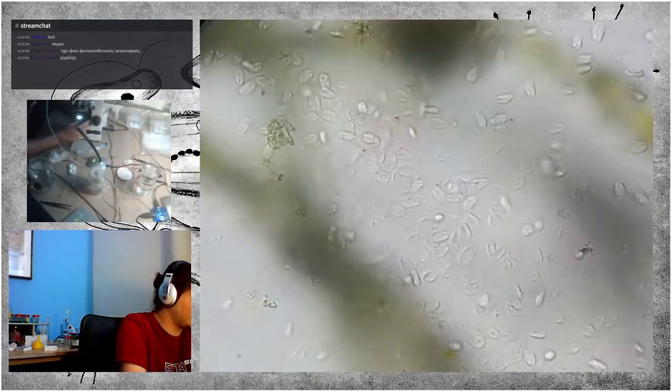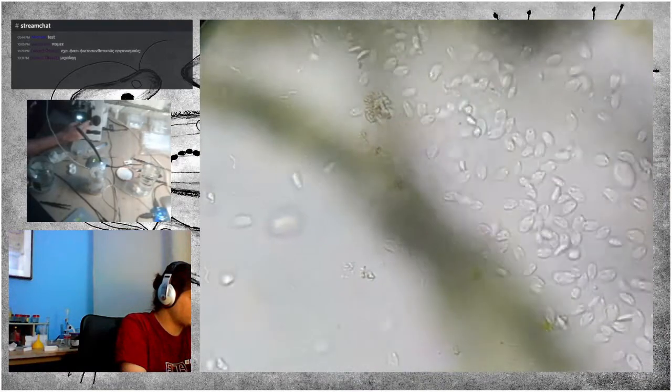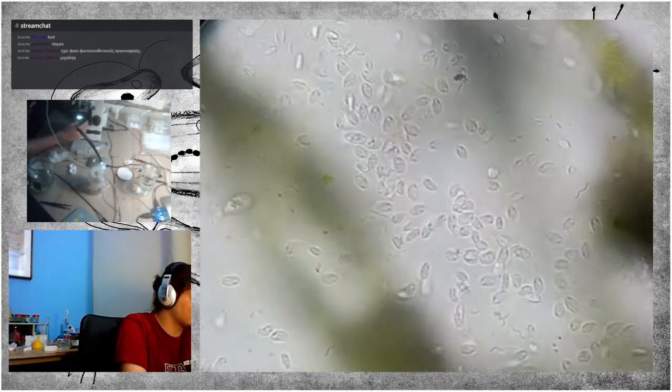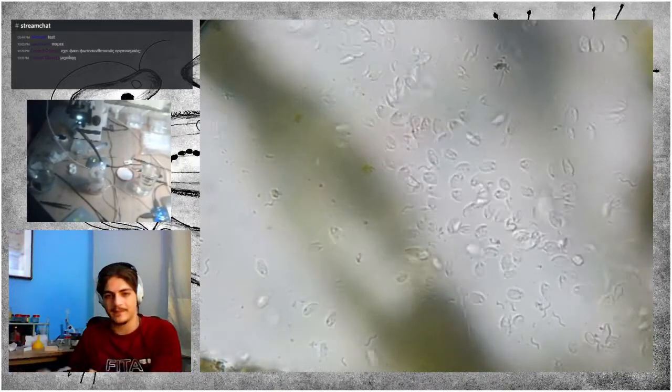I have seen in that large of a concentration only flagellates of probably the genus, let me see it again.